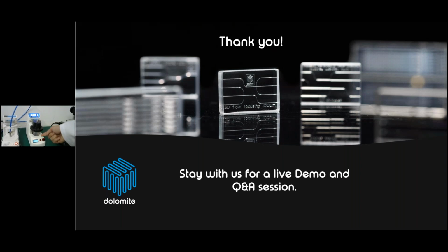Inside the pressure chamber we put the sample vial, and the sample chamber is connected to the chip through the flow rate sensor here, which can measure the flow rate very precisely. With the sensor display, you can visualize the real time flow rate on the pressure pump.